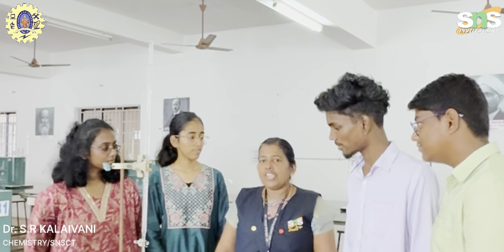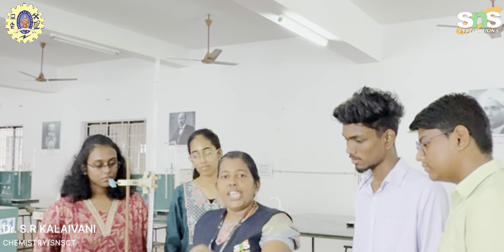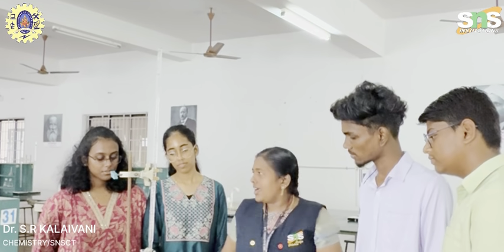Good morning. Today we are going to discuss the estimation of hardness of water by the EDTA method. First, what is meant by EDTA? EDTA means ethylene diamine tetra acetic acid.